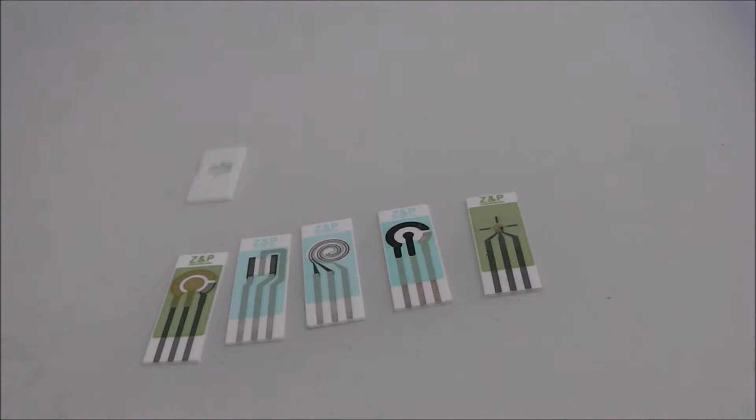Obviously, Zimmer and Peacock have a range of different electrodes. This is not the full range. Different metals, gold, carbon, platinum, etc., different electrode reference materials, different dielectrics.